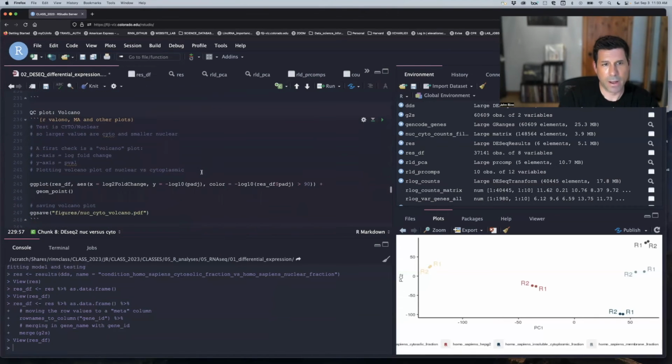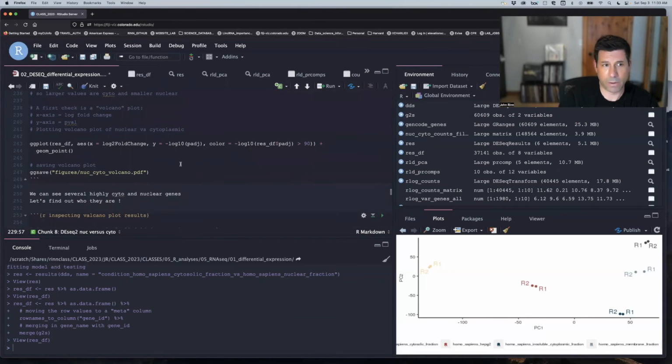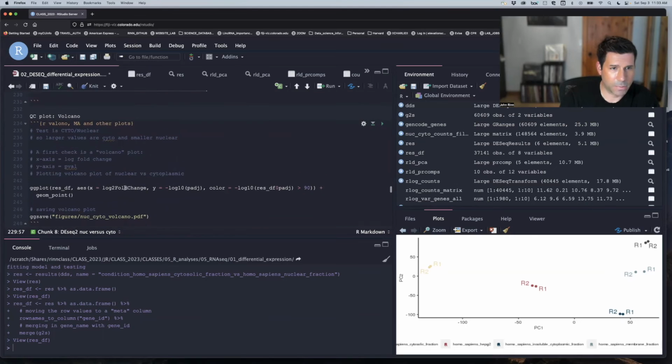because really we can go right from there and start to do a bunch of analyses, heat maps. We're going to do a volcano plot right now, which is a common thing to do, where you say the bottom is fold change and then p-value. And so what you're saying is that as you get more and more of a large differential expression, does your p-value go up? And we'll make that sort of plot here, which is very simple now.